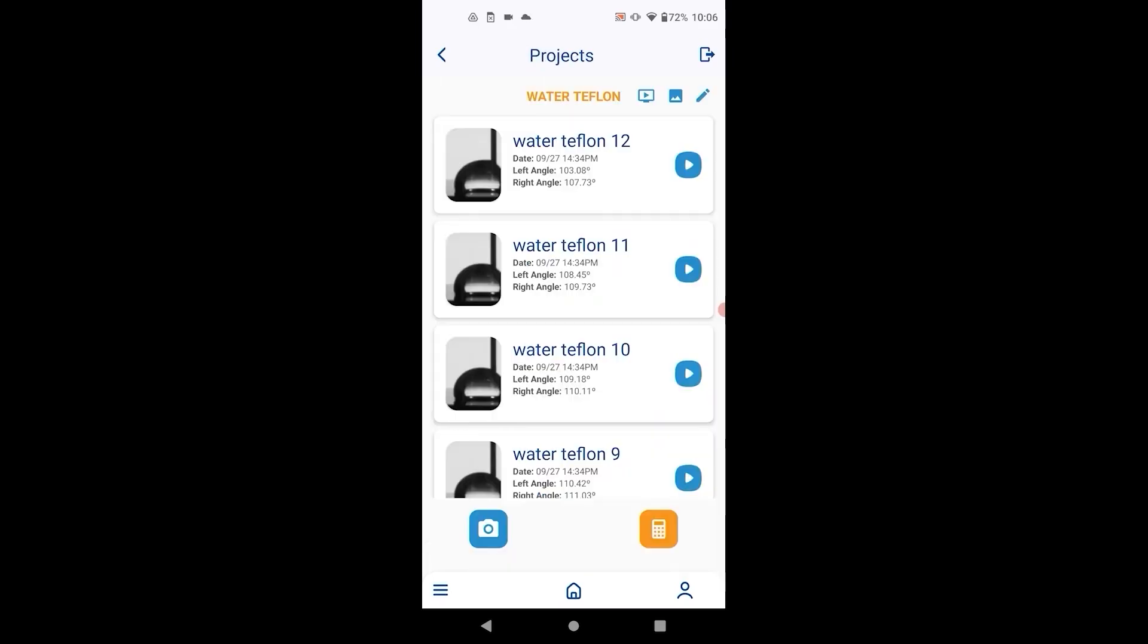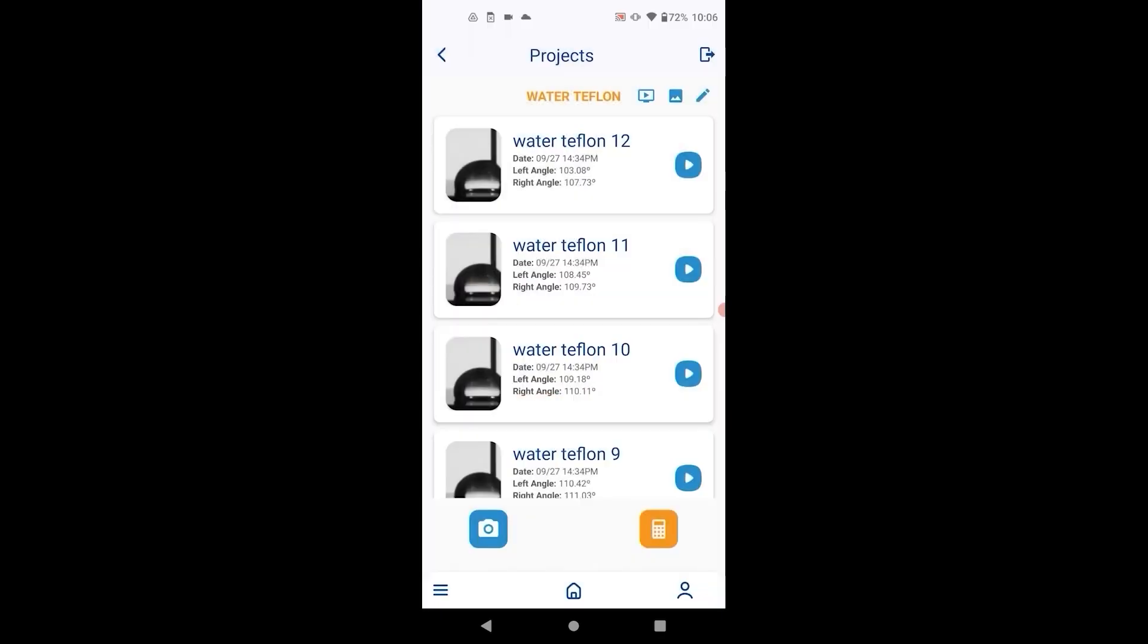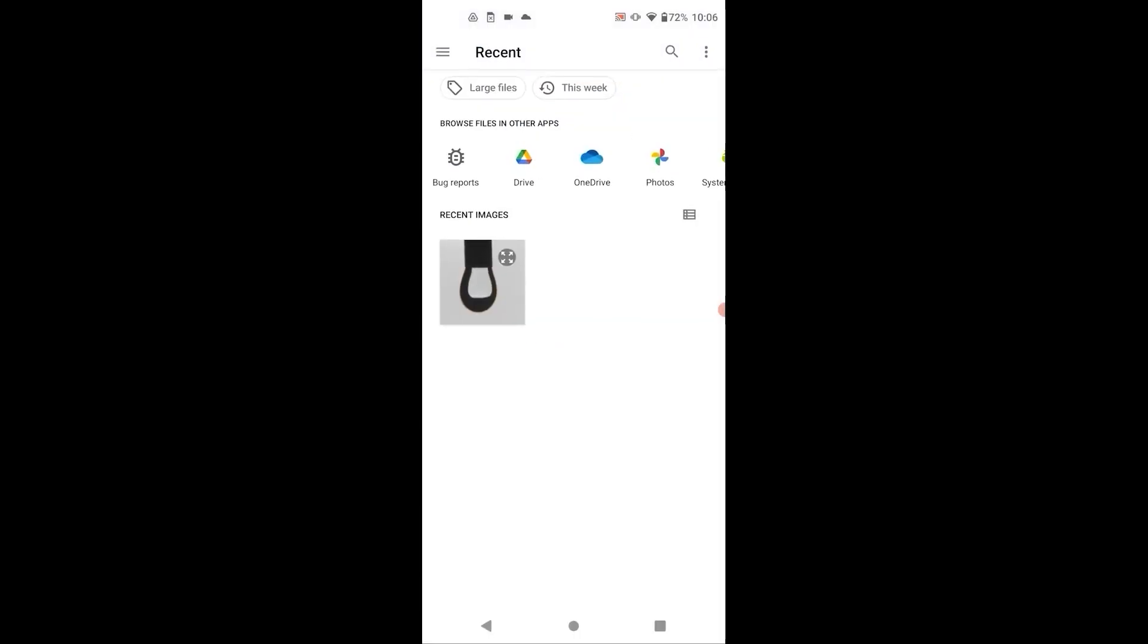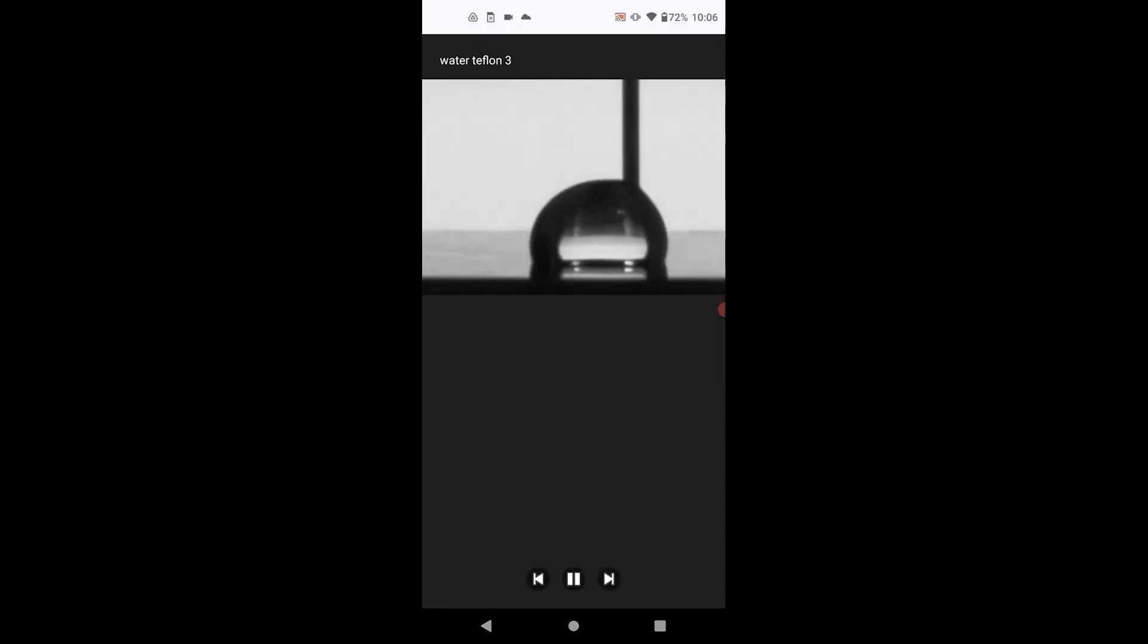A few features that can be accessed from the project screen. The project parameters can be edited. You can load external images into the project. You can also run a video slideshow of the images in the project in chronological order.